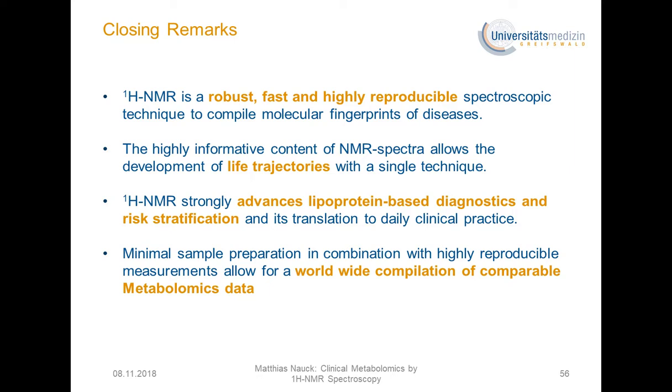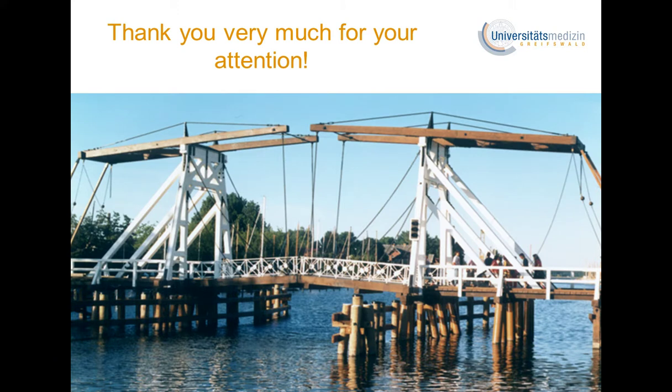The NMR strongly advances lipoprotein-based diagnostics and risk stratification and its translation to daily clinical practice. And the minimal sample preparation in combination with highly reproducible measurements allows for a worldwide compilation of comparable metabolomics data. So I'm at the end of the talk, and thank you very much for your attention.